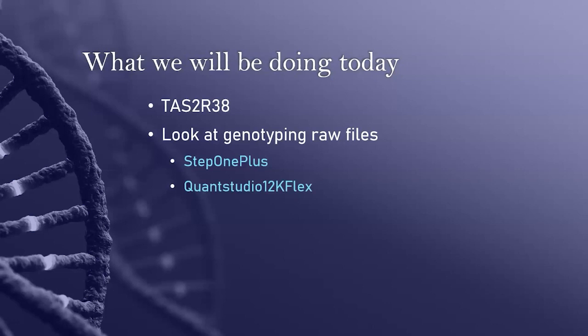Listed here, you're going to see the two RT-PCR machines, which stands for real-time PCR, which refers to the group of machines that can not only amplify the DNA, but also make readings in real time about what's happening with the DNA. The first machine here is the StepOne Plus, and the second one is the QuantStudio 12K Flex.